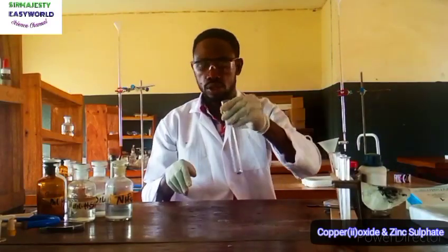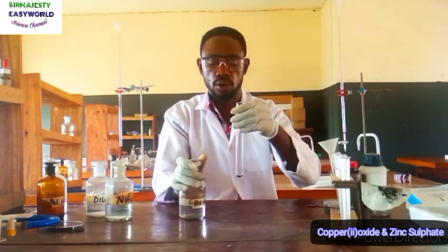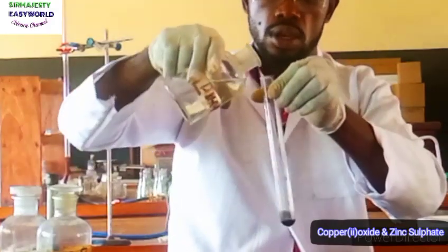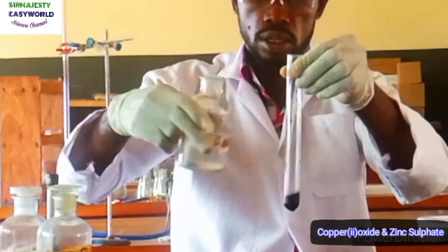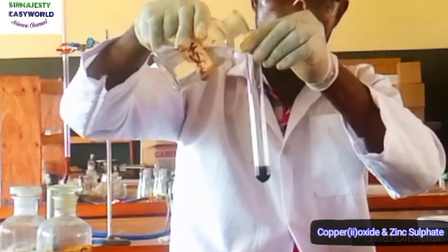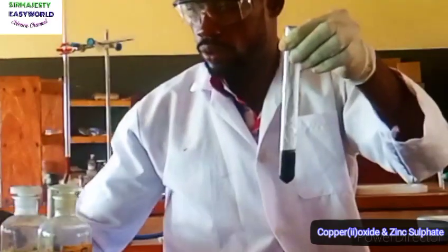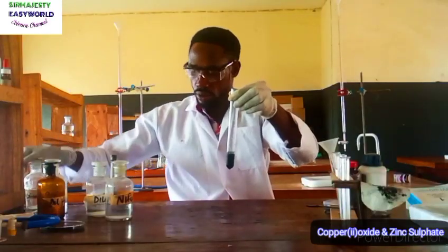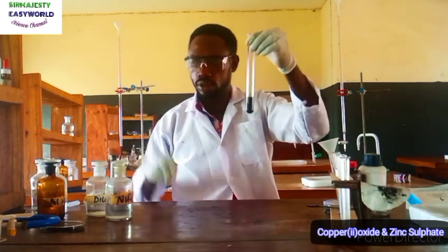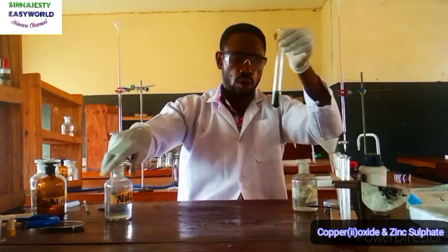According to the question, we should add about 5 ml of dilute H2SO4 to the residue. You can use this to run down the whole thing. So you're adding, and then warm gently. See, even before warming, it's slightly dissolving. So the next step is to warm gently.